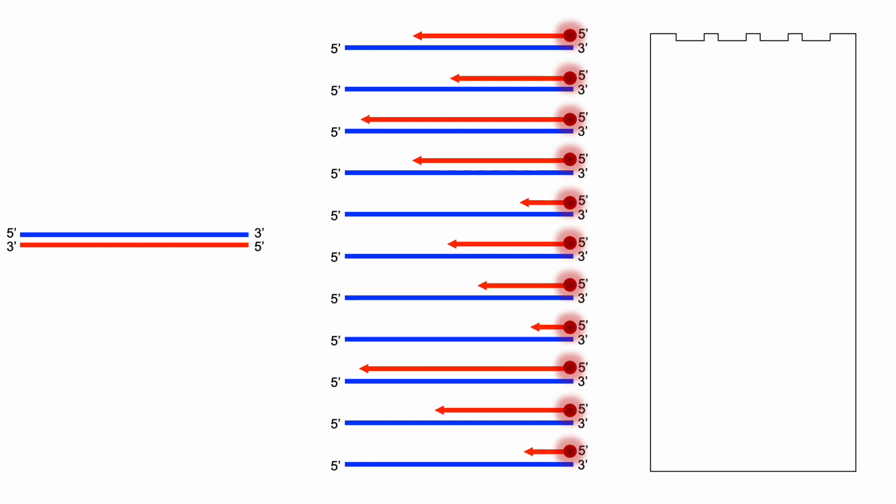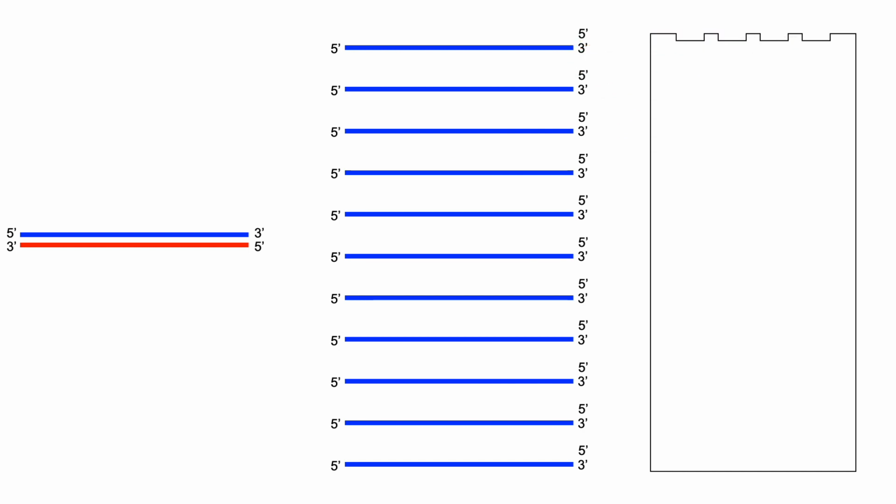So we're going to take our sample and load them all up on the gel. As the gel runs, they're going to separate out into bands. Down here at the bottom is the shorter length product. These are the ones where it terminated a lot earlier, in the beginning of the sequence. Whereas up here, these are the longer length ones, the ones where it went a lot further. And you get this separation here. And this is just an example of one nucleotide.